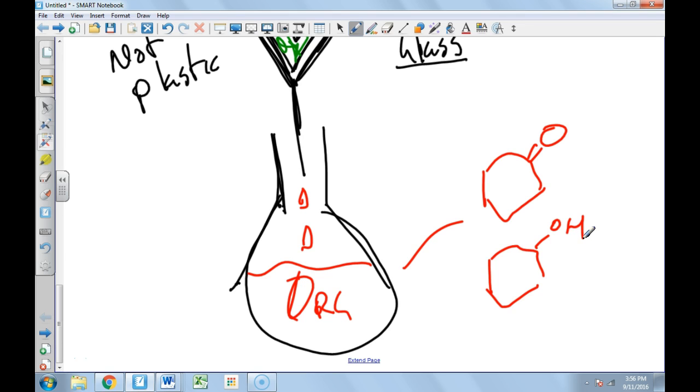Bleach is a pretty strong household oxidizing agent, so it pretty much oxidizes the junk out of everything. So at this point, there's also a whole bunch of ether in there. So now we want to purify and get just the cyclohexanone.